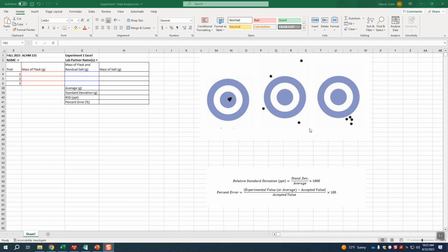You do this 4 times, and instead of getting 0.15 grams, you get 1 gram and 0.01 gram and 0.2 grams and 0.4 grams. So you can't get the same thing every time, and it's not close to the 0.15 grams that you expect. So this is not accurate and not precise.